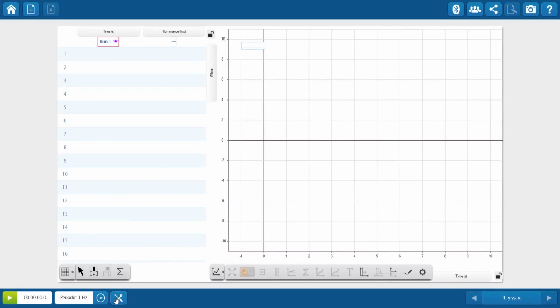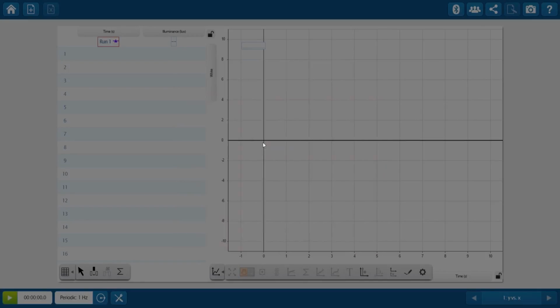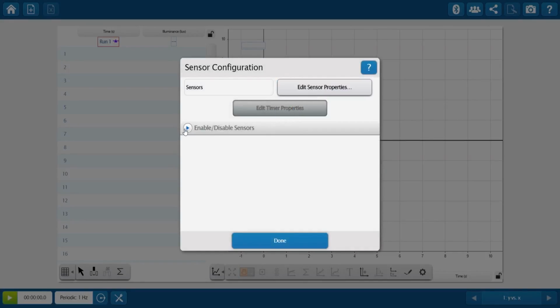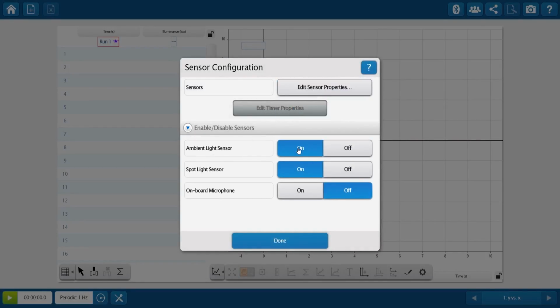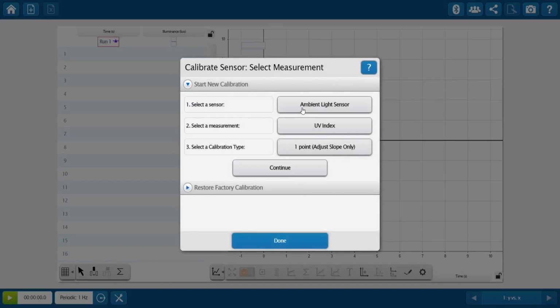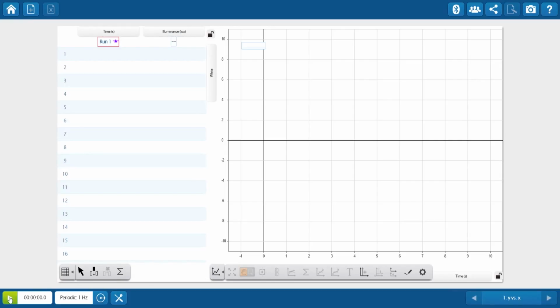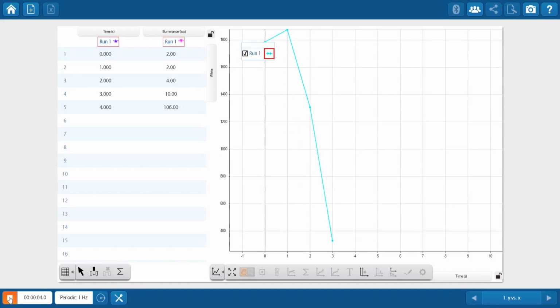The second is the introduction of a hamburger menu, which contains the options for new experiments, preferences, language settings, shared sessions, and help. The chooser screen is also split into two sections. The top section is for setting up the collection of data, either manually, using a sensor, or remote data logging. The bottom half involves opening or building Spark Labs.